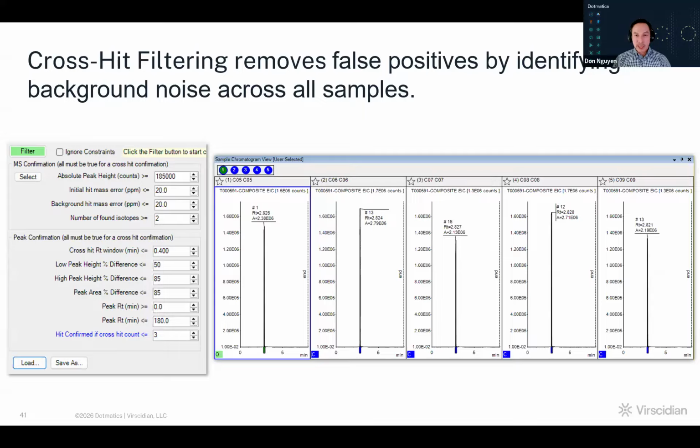We may need to finagle a little bit how the data gets split up and parsed out for KD analysis specifically. So that's more of a technical question and not a scenario that we've run into yet, but it is technically feasible in terms of bringing that data in and analyzing it.